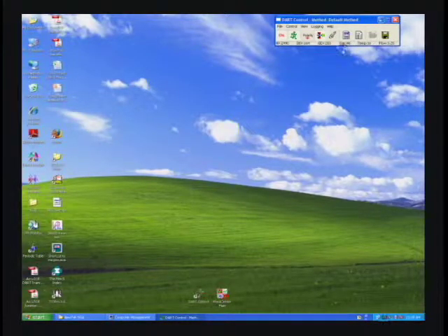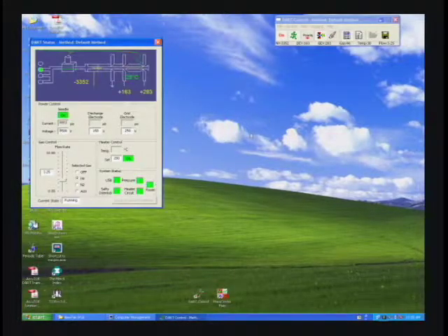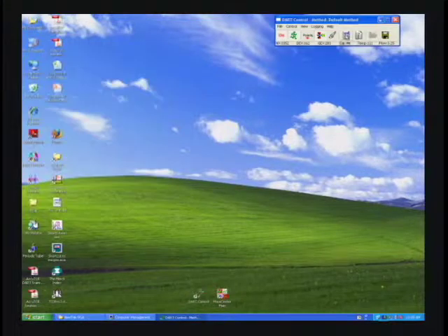over to run. If we want to see what's actually going on, there is a parameter page here that shows you the current condition of the DART system. The glow discharge needle is on, the grid voltages are on, the DART gas heater is warming up to temperature, and helium is flowing. While that's happening, I'll go ahead and start up the mass spectrometer.